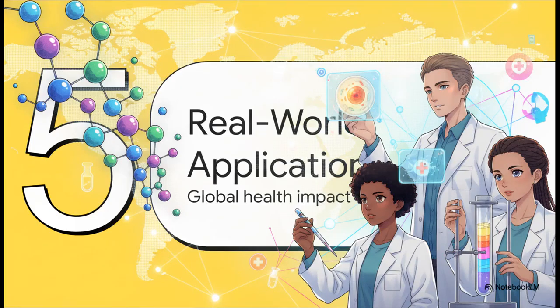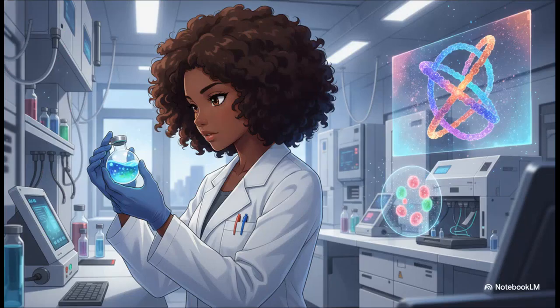Finally, Section 5, Real-World Applications, the Global Health Impact. Despite those limitations, the raw power of this technique makes it universally utilized. So why does this matter to the world? Well, the scope of its applications is just massive. It's the absolute gold standard for protein purification, isolating enzymes, hormones, and therapeutic proteins for pharmaceutical research. It's absolutely crucial for biomarker isolation, letting us pull specific disease indicators right from blood or serum for clinical studies.